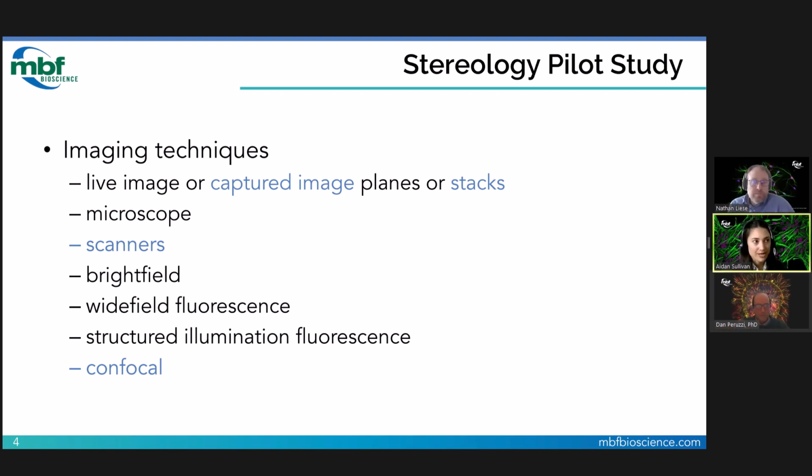To image my sections, I have used a resonance scanning confocal microscope and acquired slide scan image stacks of the top right region in my coronally sectioned tissue with a 63x oil objective.